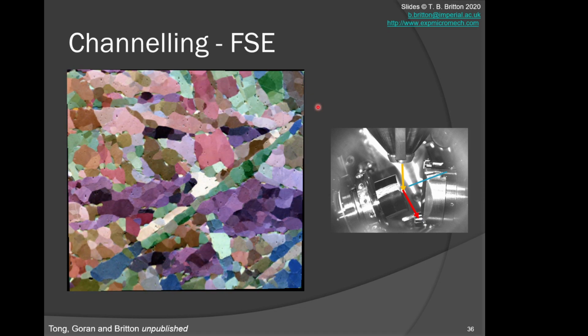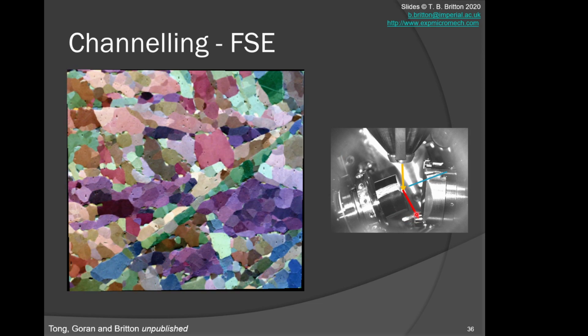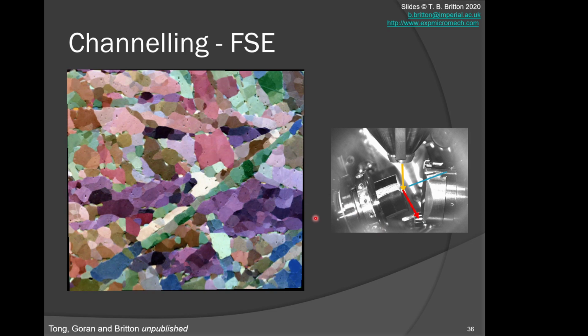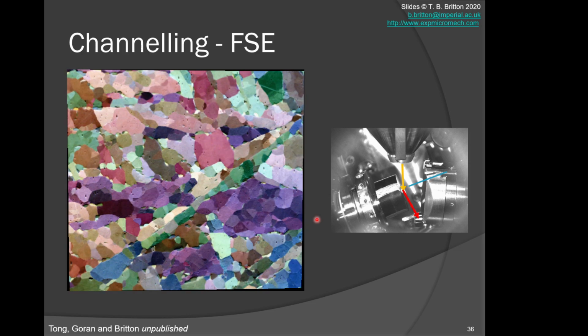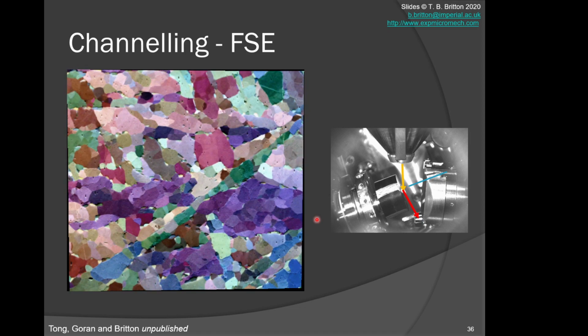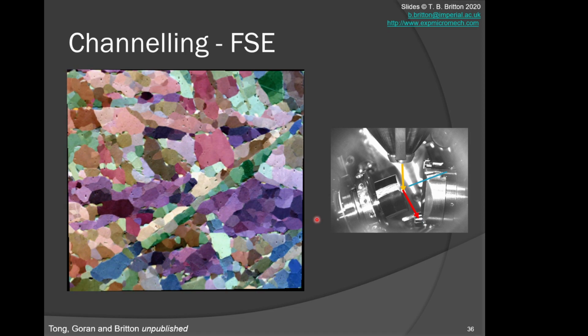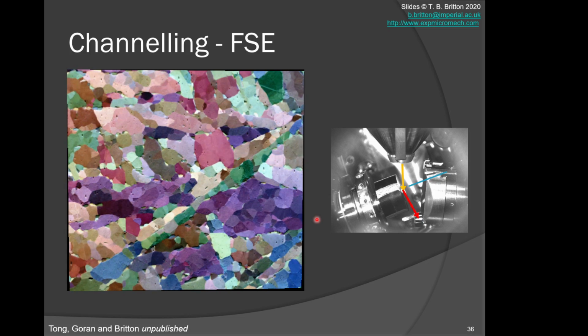So if you have a backscatter detector, or forward scatter detector, so the electrons have moved forwards in this case, but they're scattering backwards, scattering forwards in this case. We have 3 detectors, RGB. We can get effectively very beautiful images. So actually, this is now published. Space Rocks is the paper name, by Vivian Tong, Daniel Gorin, and myself. In this particular example, effectively, we're rotating the sample with respect to the primary beam. We're imaging back to the same position, and we reveal effectively the substructure in this meteorite sample. And we can see effectively lots of small angle grain boundaries, as well as a series of different variants in this FCC BCC crystal structure.